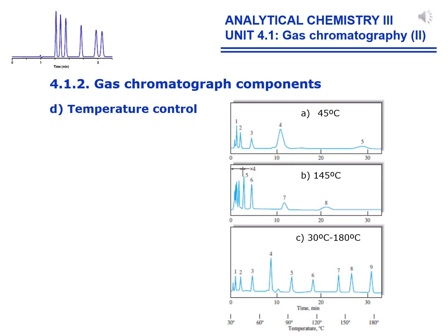The above statements are shown in this practical example, where we can precisely see the influence of temperature in the separation of 9 compounds. A temperature too low, 45 degrees, leads to a bad separation as the 5th compound is too retained, then almost undetectable. And the situation is even worse for compounds 6, 7, 8, and 9, not registered in this chromatogram.